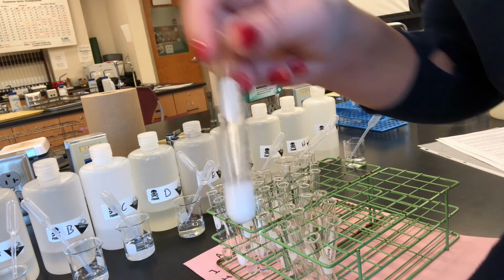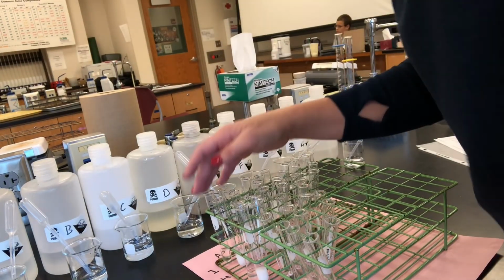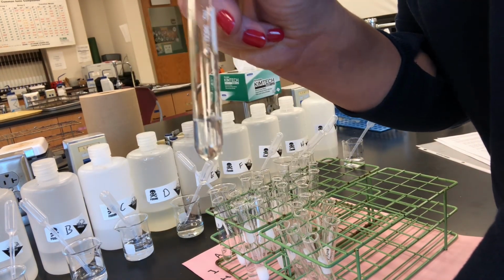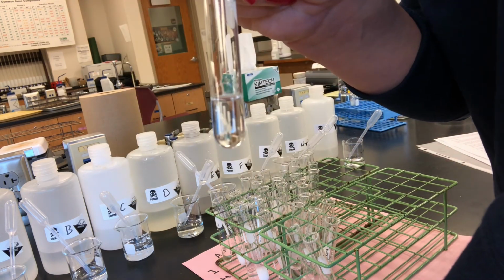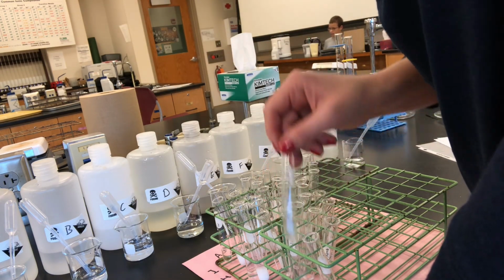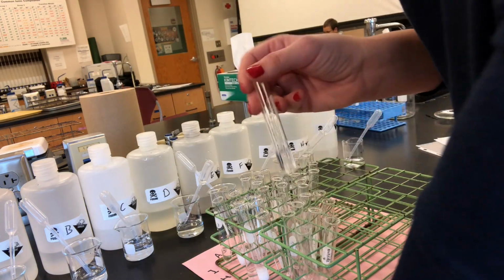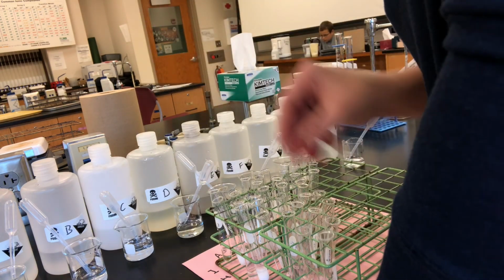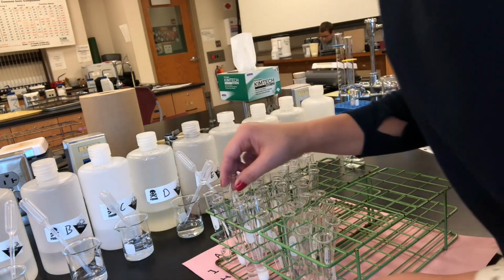Let me zoom in just a little bit. Just kidding, it won't zoom. That was A and F. A and E, no change. A and D, nothing. A and C, nothing. A and B, nothing.